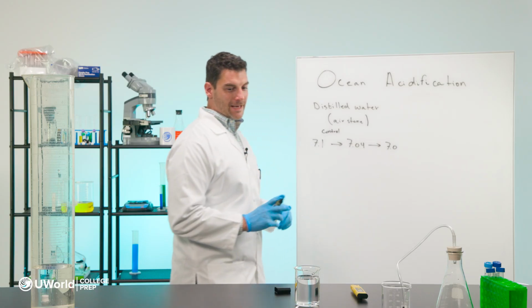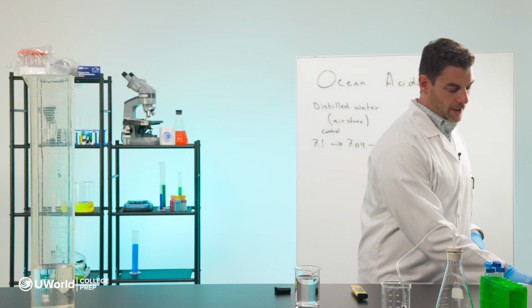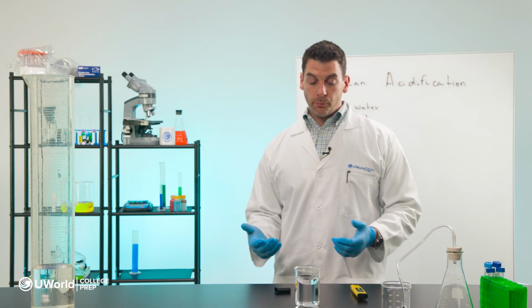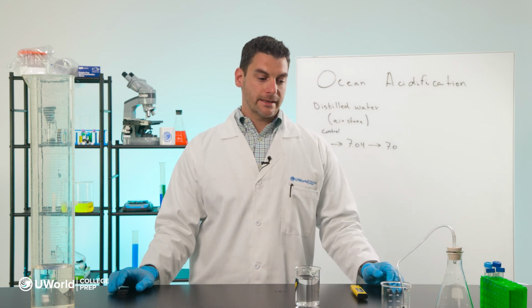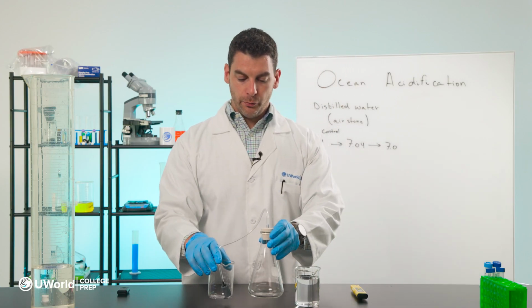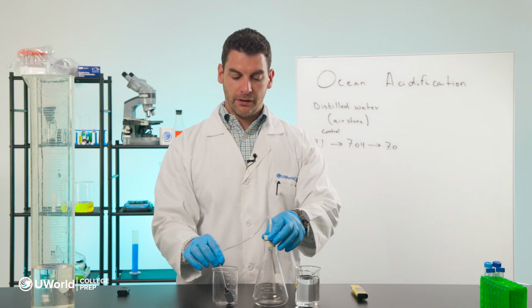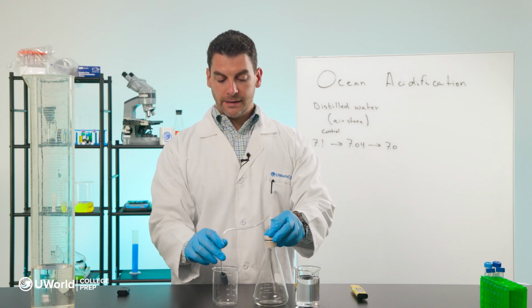So now let's test and see what it looks like with the creation of carbon dioxide. For the second part of the lab, we are going to have a little bit more intense setup. This time, we need our apparatus with our tubing and our air stone attached. And you can see I've already attached that. The stopper has that tubing.